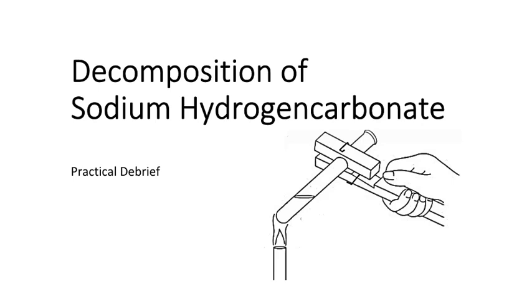Hi everyone. Today's practical walkthrough focuses on a key skill in your SPA: collecting accurate mass data, applying mole calculations, and identifying unknowns. This practical is commonly tested in Paper 3, and it develops skills in data analysis, interpretation, and evaluating chemical changes. Let's get into it.